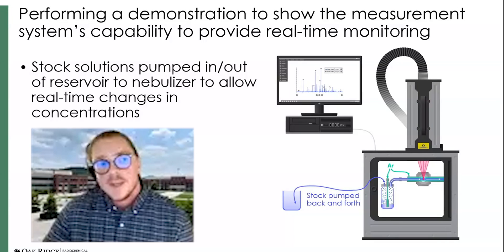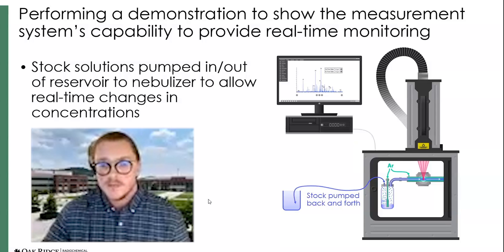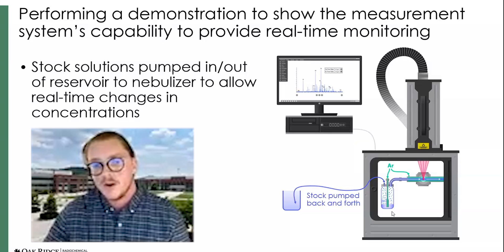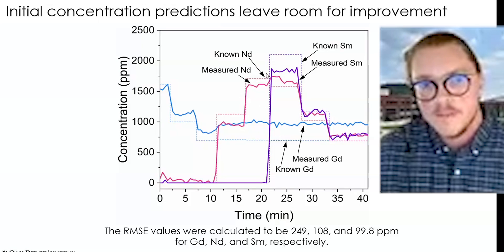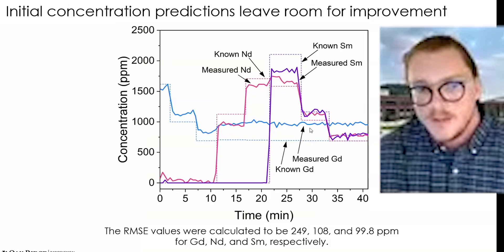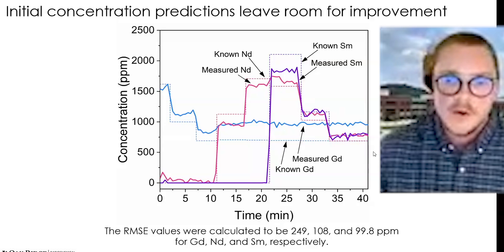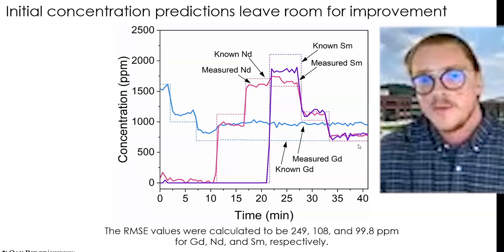Building a calibration model is one thing, but what we really wanted to show is how our sensor could be used in a real-time test. We have our measurement system in our laser enclosure and can pump stock solutions back and forth to change the concentration in our liquid reservoir in real time. The dashed lines are based on ICP grab samples, and the solid lines are our model predictions. Things don't look as good as expected off the bat — especially with gadolinium, there is a big discrepancy in a large region. So we had to step back and ask, even though our validation samples look good, is there any other way we can enhance the predictive capabilities?